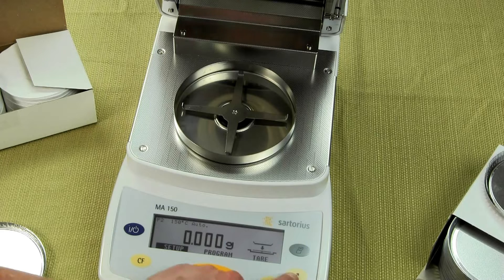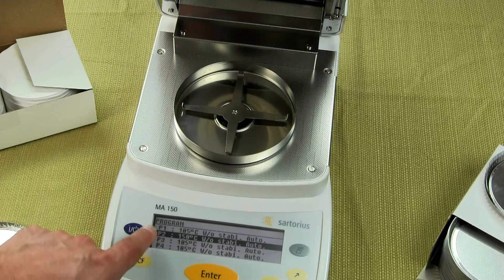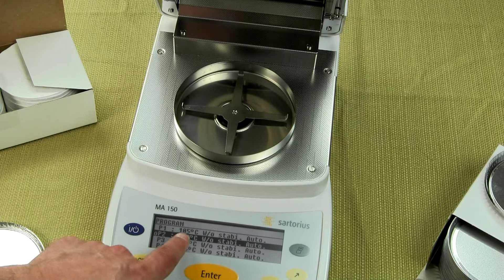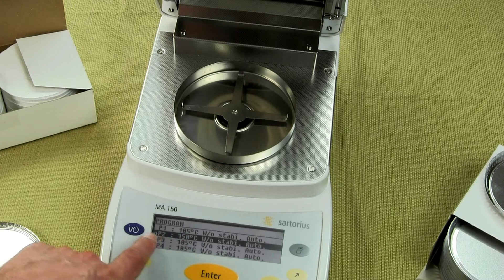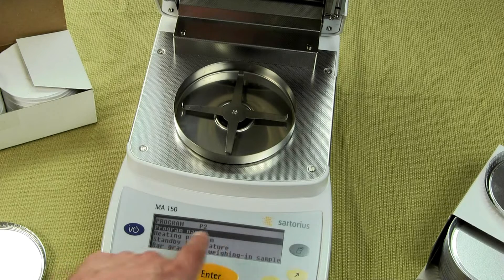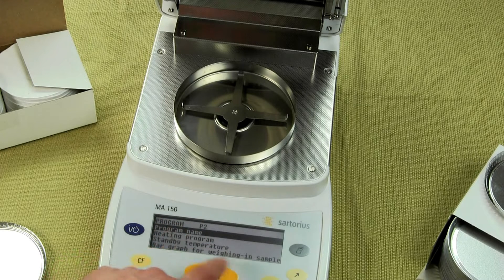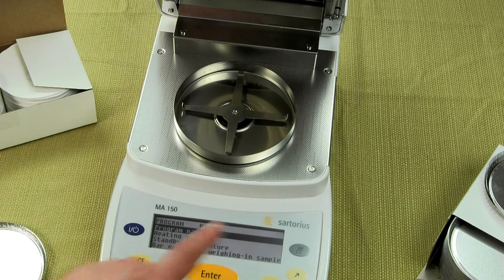We go into program setup and select program. You can see right here, program 1 is set at 105 and program 2 is set up to run at 150. You can actually go into the menu, name the program, and there are alphanumeric keys. So if you want to spend the time, you could specify that this particular moisture test is for, say, toothpaste.